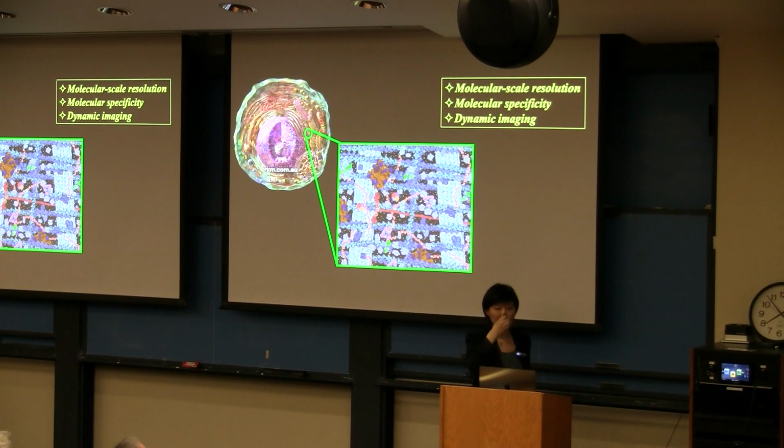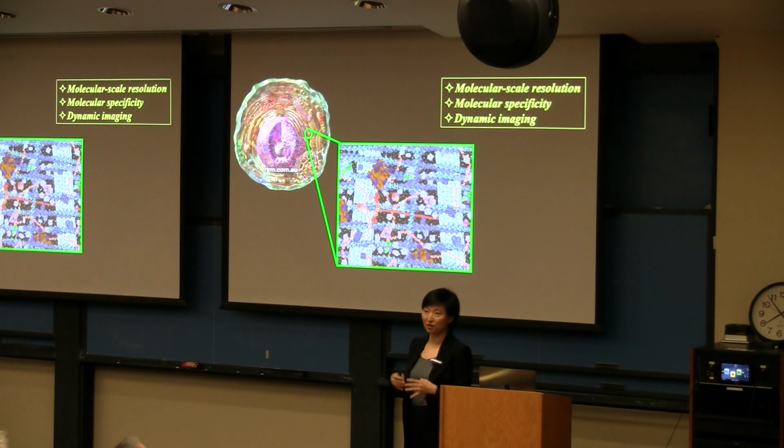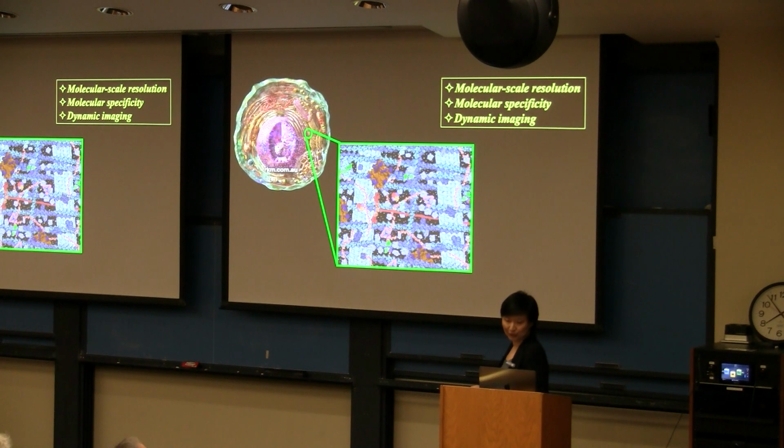So if you look at these three requirements and think about what kind of microscope does pretty well, you quickly think about light microscopy, and in particular fluorescence microscopy. And that's because, of course, being light microscopy, we know it's compatible with living systems. After all, we go out to the sunshine and get sunbathed without getting hurt too much.